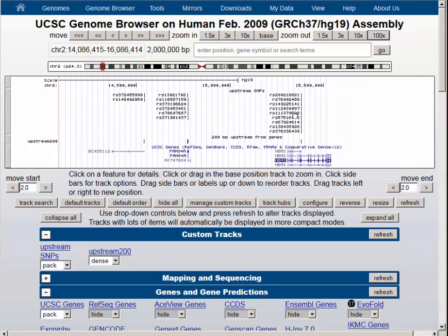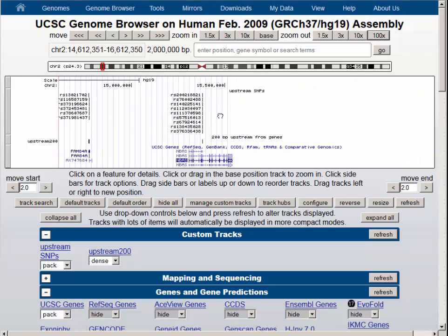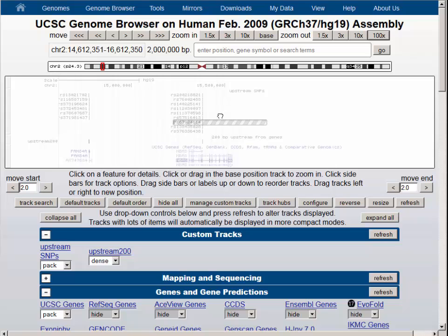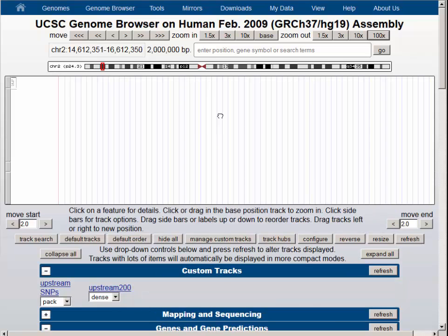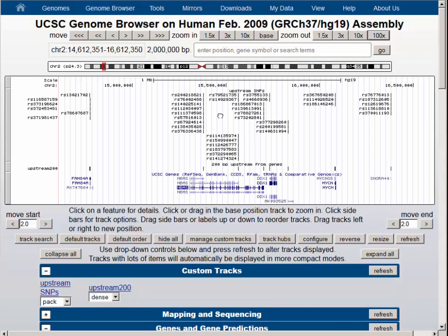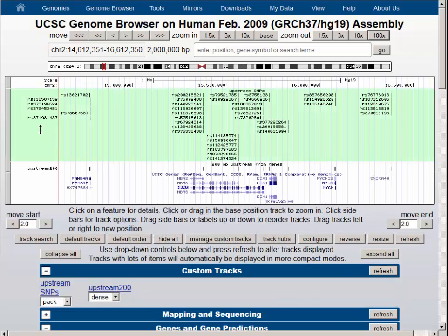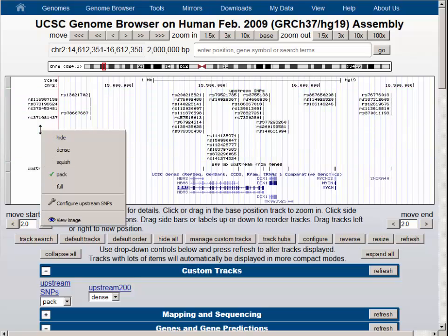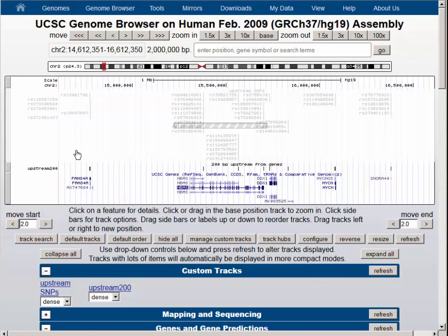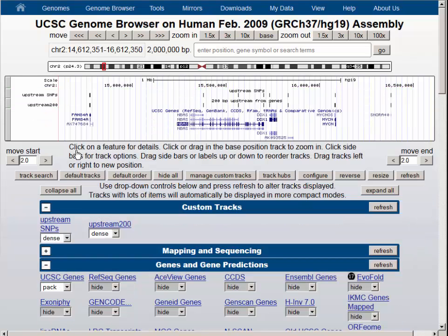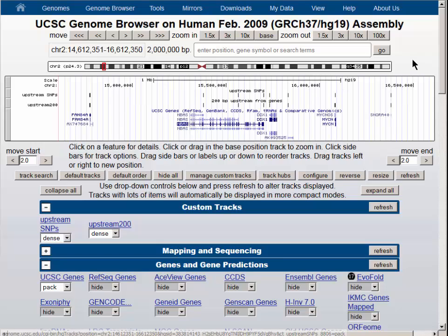Let's pan over to the right a little bit now and we will pick up the DDX1 gene as well. Then we will collapse the SNPs back down to dense visibility and you can see that there are SNPs in each of the regions that we chose for our upstream regions.